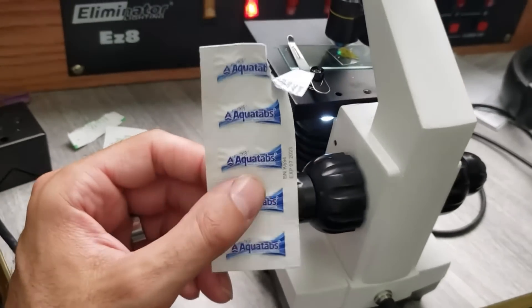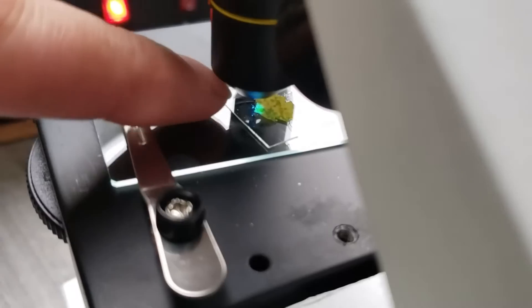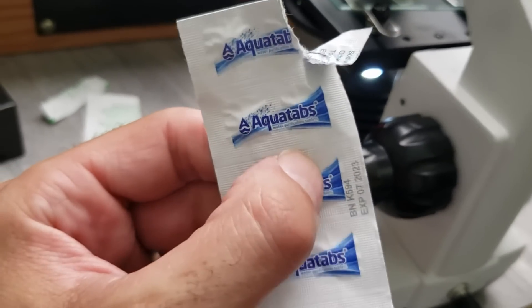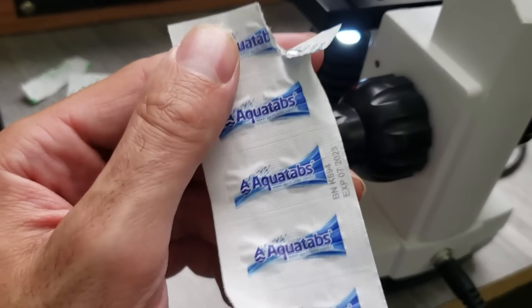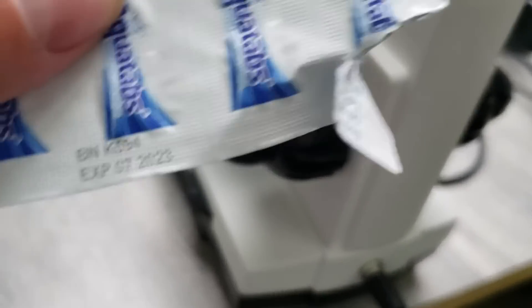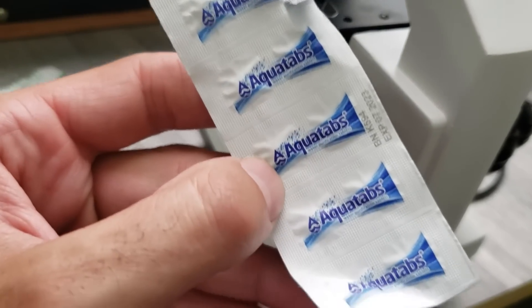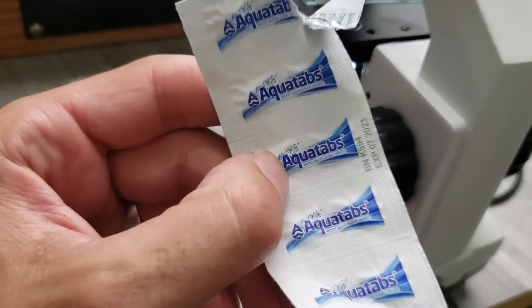All right guys, as you can see, these things are effective. Keep in mind, I'm literally looking at a piece of leaf that was in the water. With proper basic filtration combined with one of these AquaTabs, it's a really effective way to sterilize your water for drinking. And another side note — these are due to expire. I've had these for several years and they're due to expire this month. So even at the end of their shelf life, they're still very effective. That's my review of these AquaTabs.